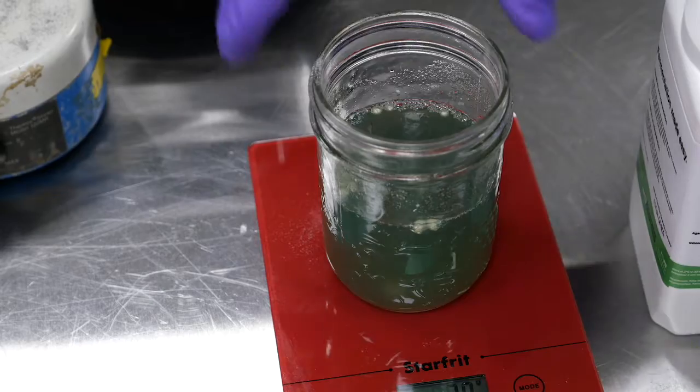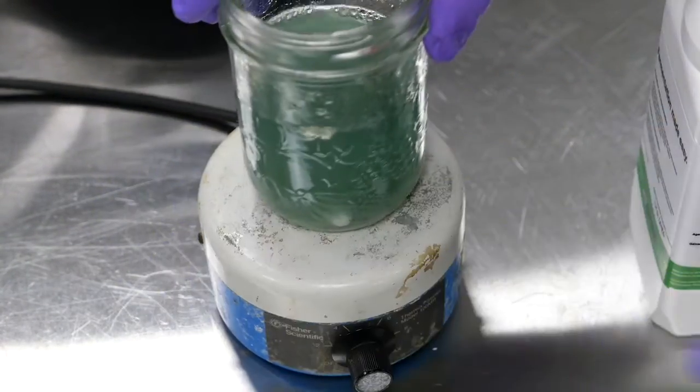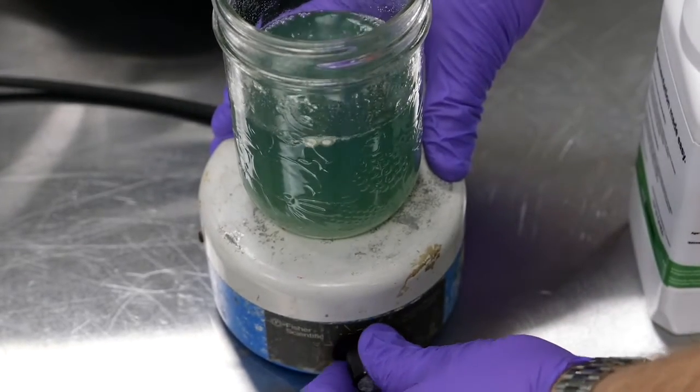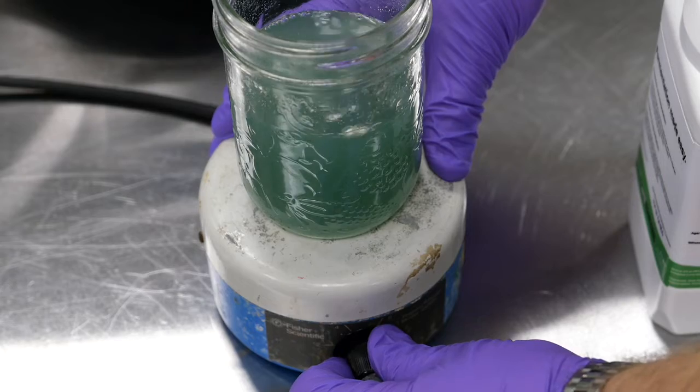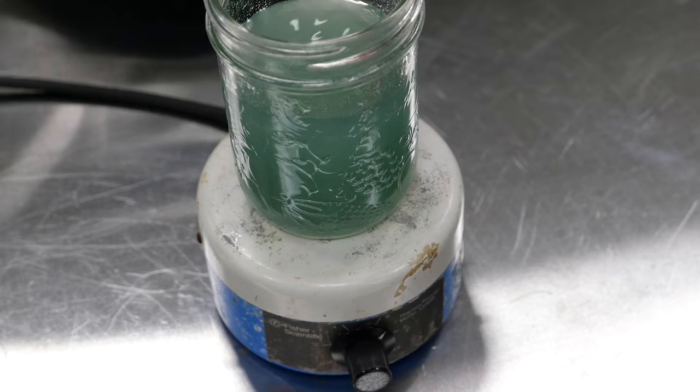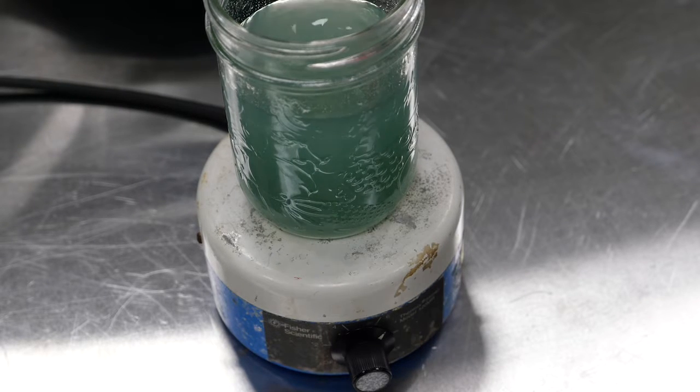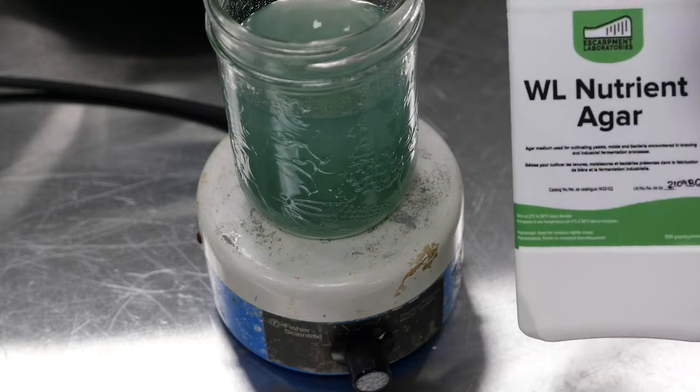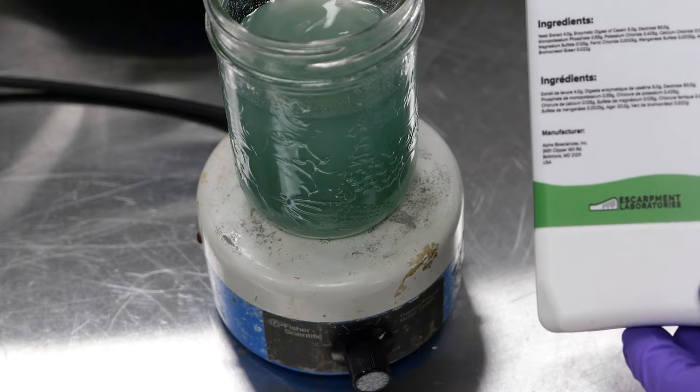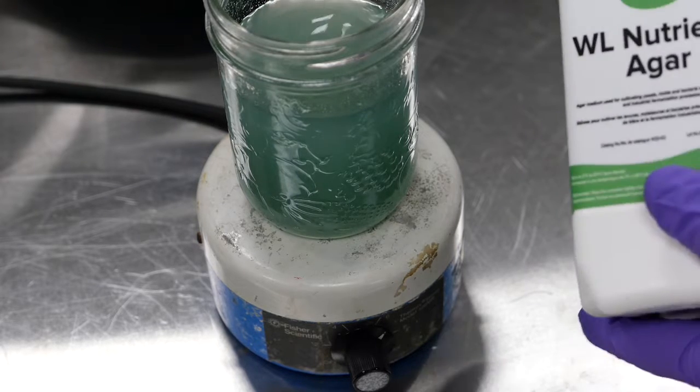So the next thing we're going to do is put it on that stir plate and stir it up. We want to see that fully dissolve before we start to sterilize it. Now these products are pre-mixed, so you already have agar in here. You already have all of the ingredients you need to make these common brewing industry quality control media. You don't need to add anything else.